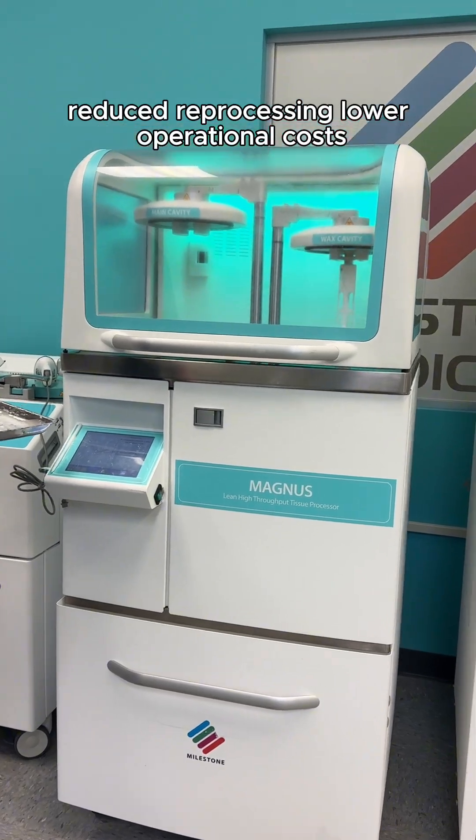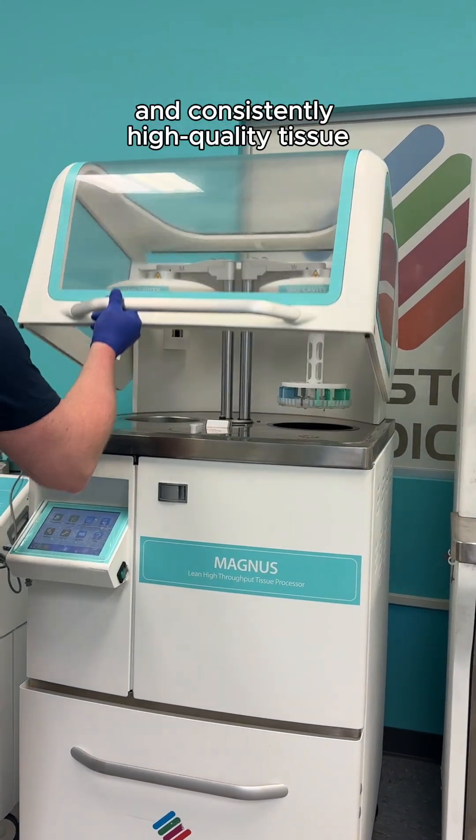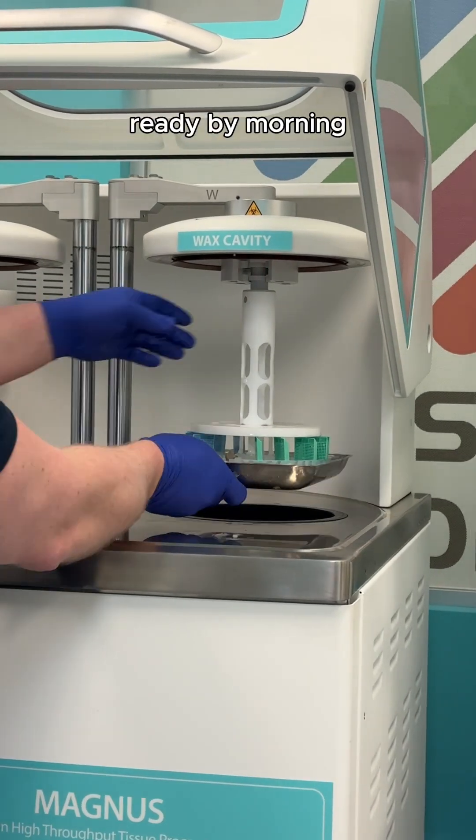reduced reprocessing, lower operational costs, and consistently high-quality tissue ready by morning.